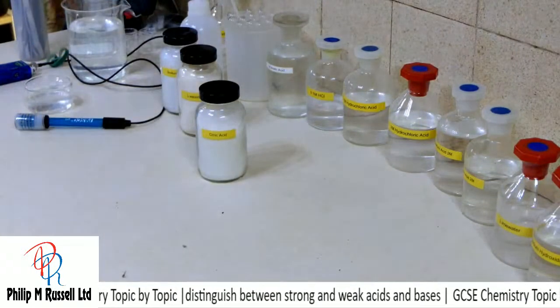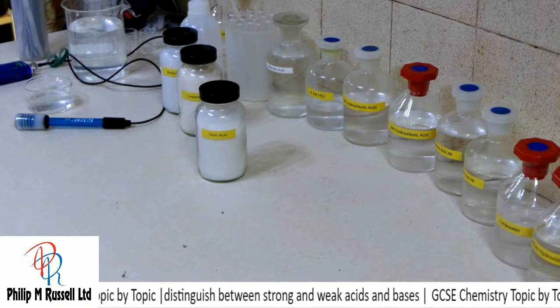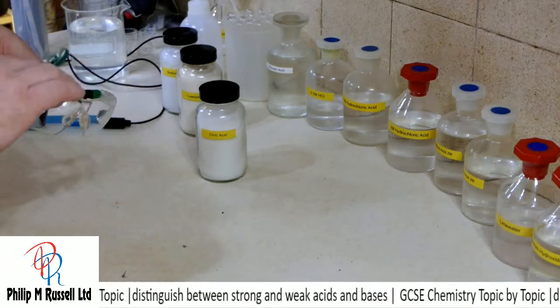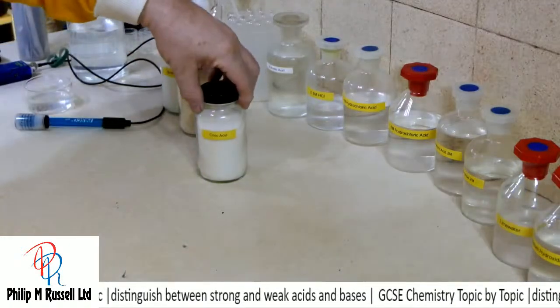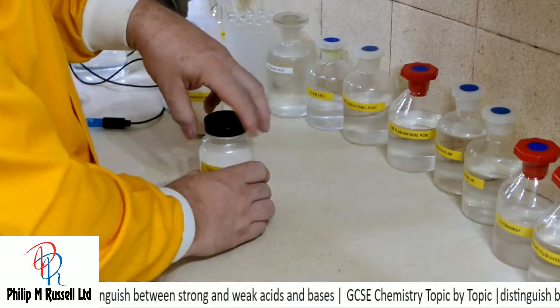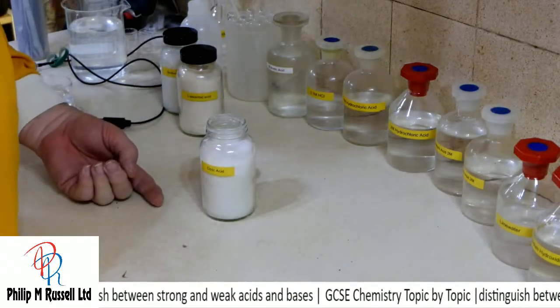If I'm going to do one of these, then I really ought to put my safety specs on. This is citric acid, and I'm going to now do something which I would not recommend anyone to do, and that is stick my finger into some acid.